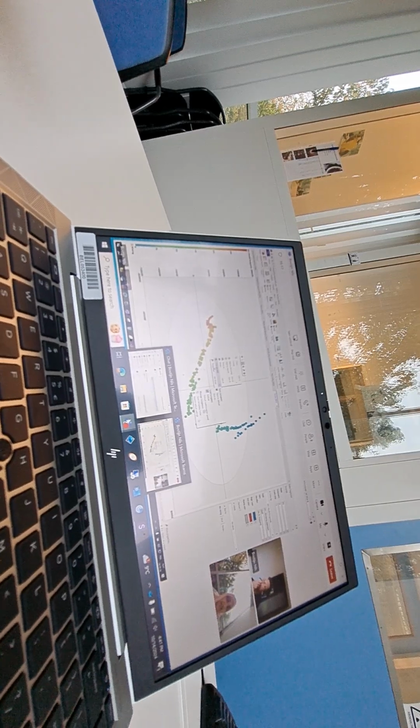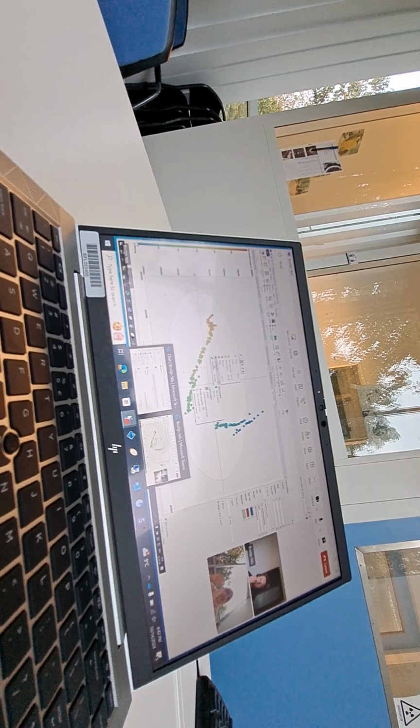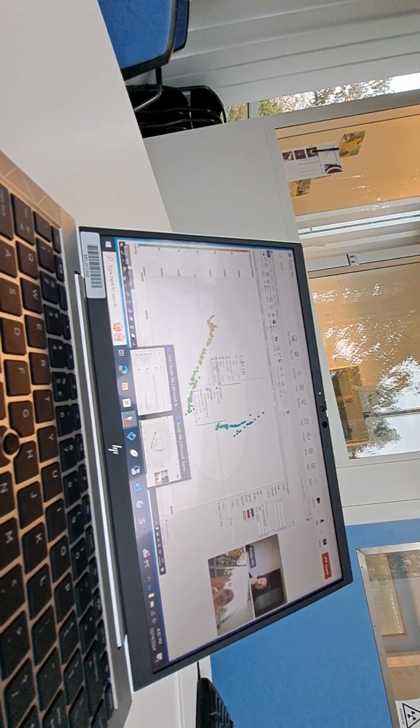In terms of presenting the data, for example, here you showed me different options, like color coding for the different phases, and I can include the XRPD when it's salt plus base and only base.